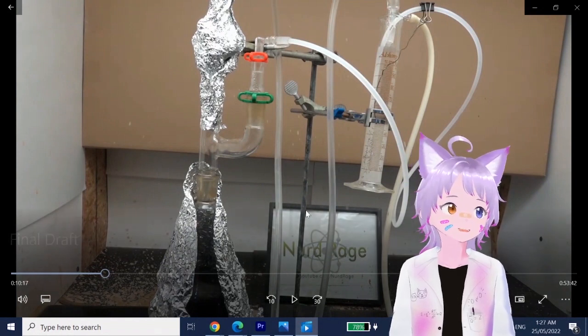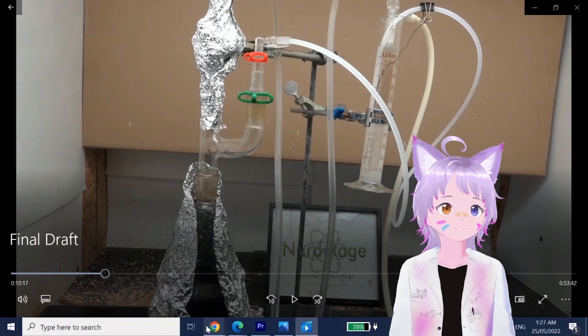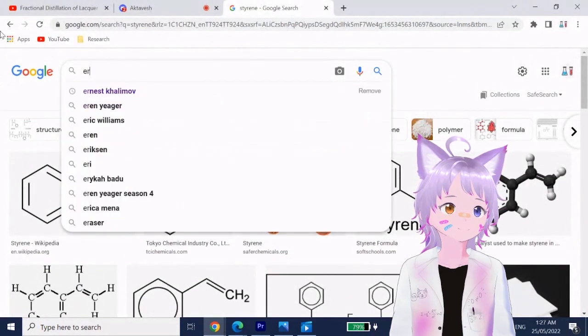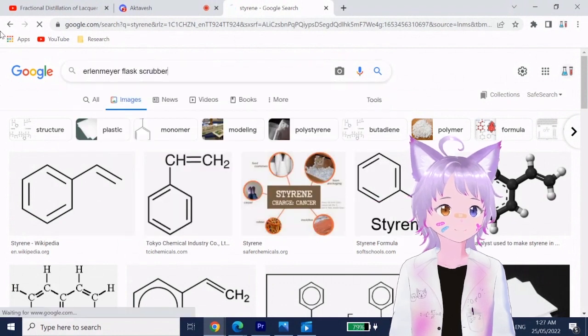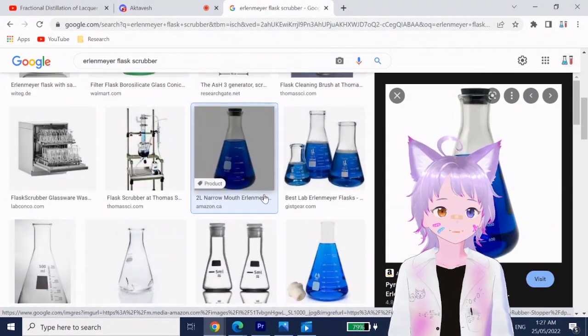Scrubber, scrubber, scrubber. That's all I will say. Oh yeah, Erlenmeyer flask with the rubber stopper. So a makeshift gas washing bottle, as they call it.